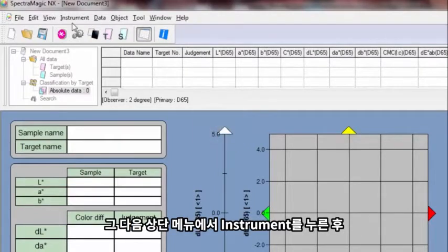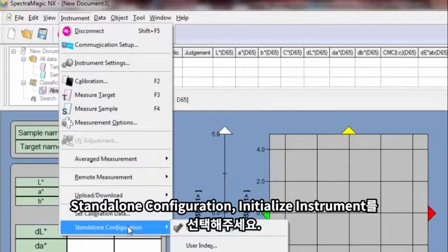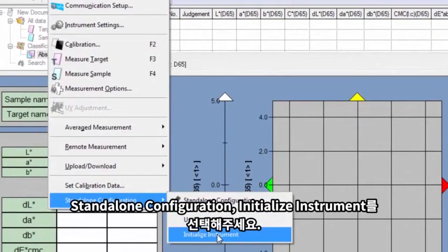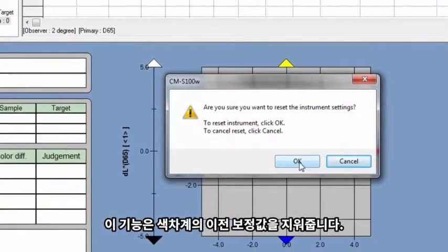Next, navigate to Instrument on the menu bar. Scroll down to Standalone Configuration and then click on Initialize Instrument. Initializing removes the old calibration data from the instrument.